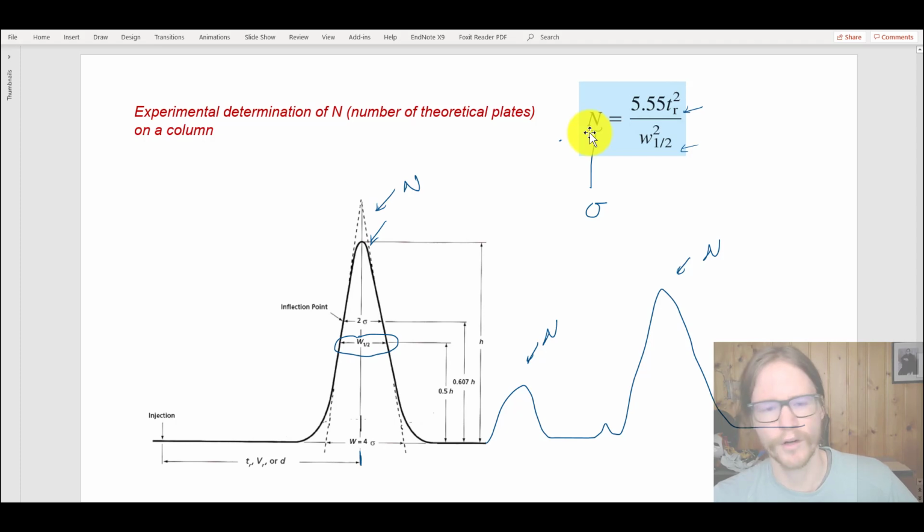So you'll do this in a workshop. It's a really nice thing, but it allows you to essentially compute how many times this analyte went through an equilibration cycle on your particular column. This is super powerful. So resolution is this sort of immediate thing, like can I separate, can I resolve two species? Theoretical plate number is really telling you, well, how good is your system? Are you going through 100 cycles or are you going through 50,000 cycles, right? And so that's sort of more abstract, but it's really powerful, and that allows us to compute and really think about how well is your analyte interacting with the system to affect a separation from other species.